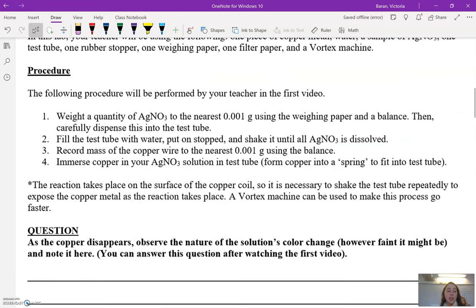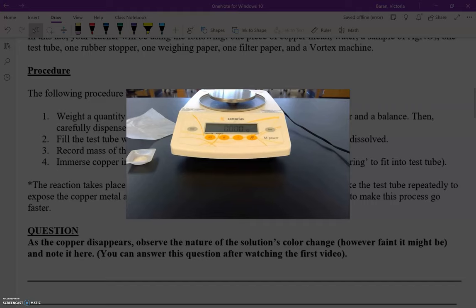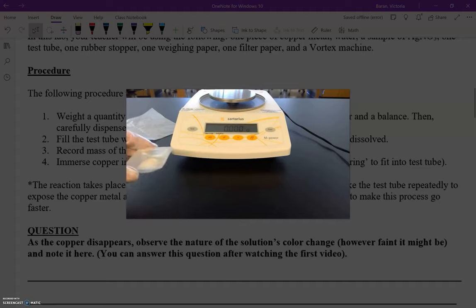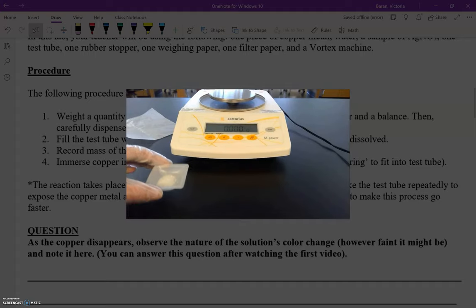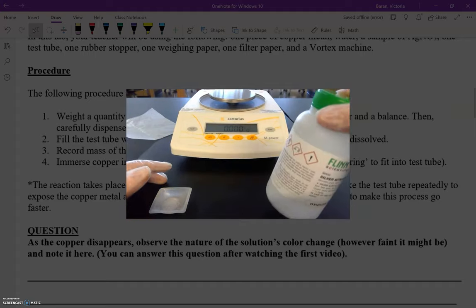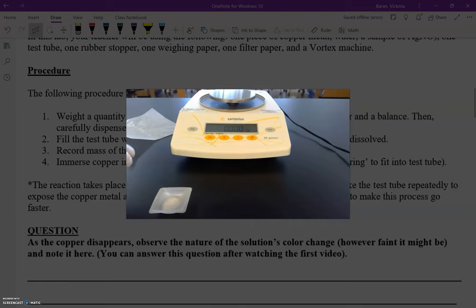So for the first step in the procedure, we're going to weigh a quantity of silver nitrate to the nearest thousandths place. We're going to use weighing paper and a balance, then carefully add it to a test tube. We're going to use a very small amount of silver nitrate. I'm wearing gloves because silver nitrate can stain your fingers — it's not dangerous unless you ingest it.